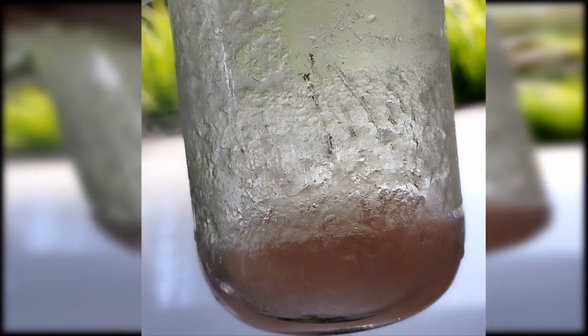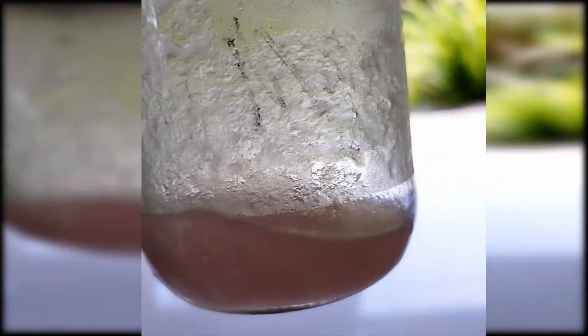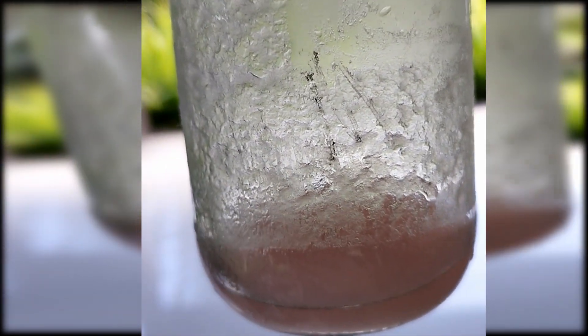Well, boys, behold my iron-free manganese nitrate hydrate solution. You can tell this thing's got no iron — it's not brown, and it's forming crystals.